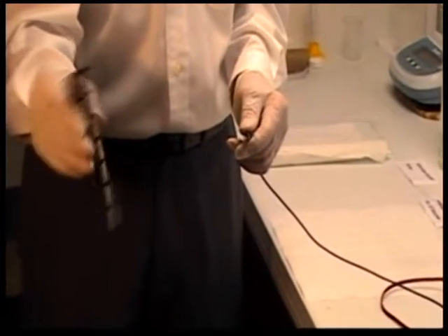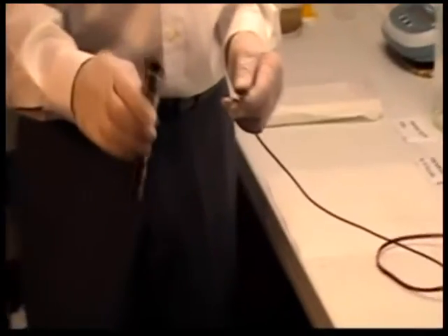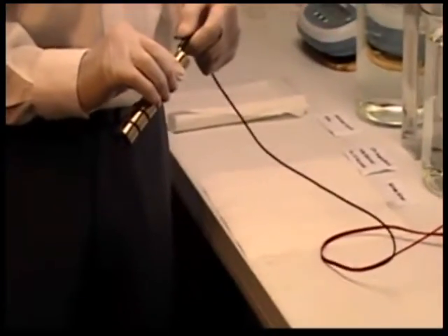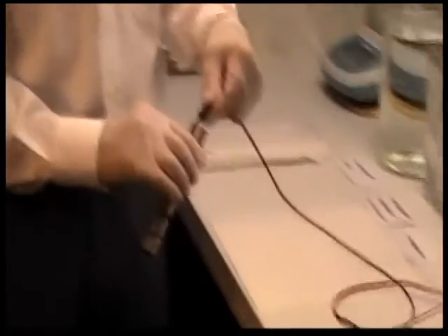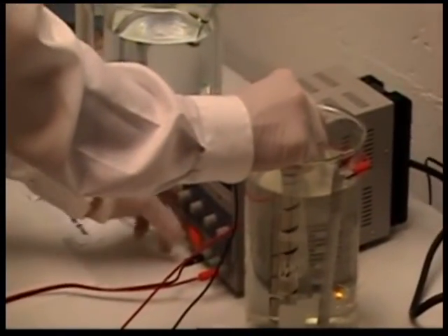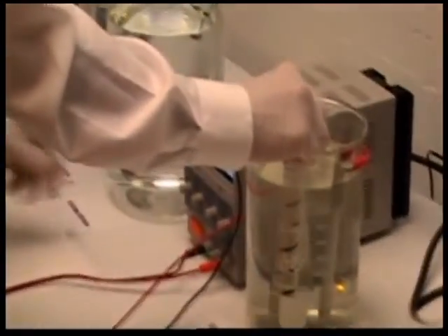How to clean and weigh the helix. Clean the helix as a cathode using negative current in an alkaline steel electro cleaner at 3 amps for 45 seconds.